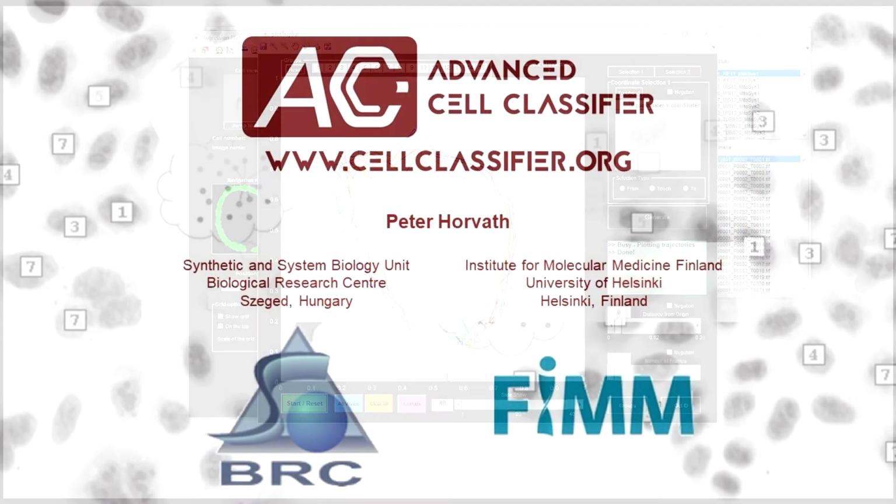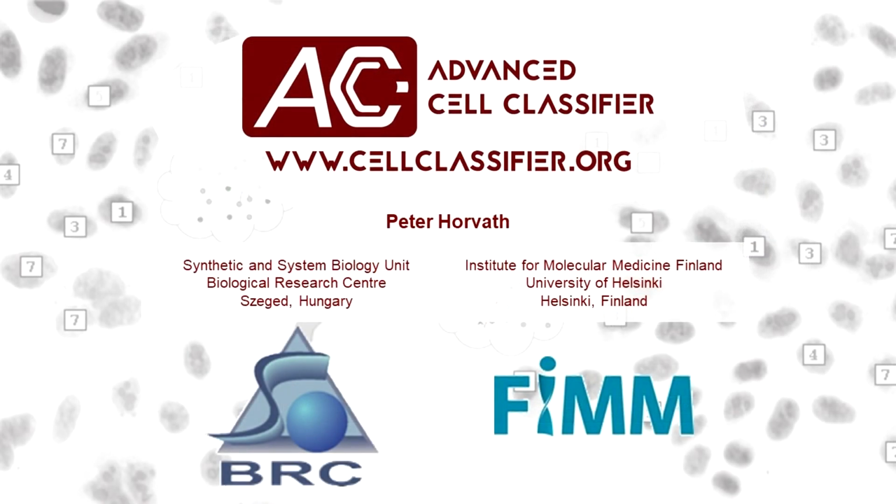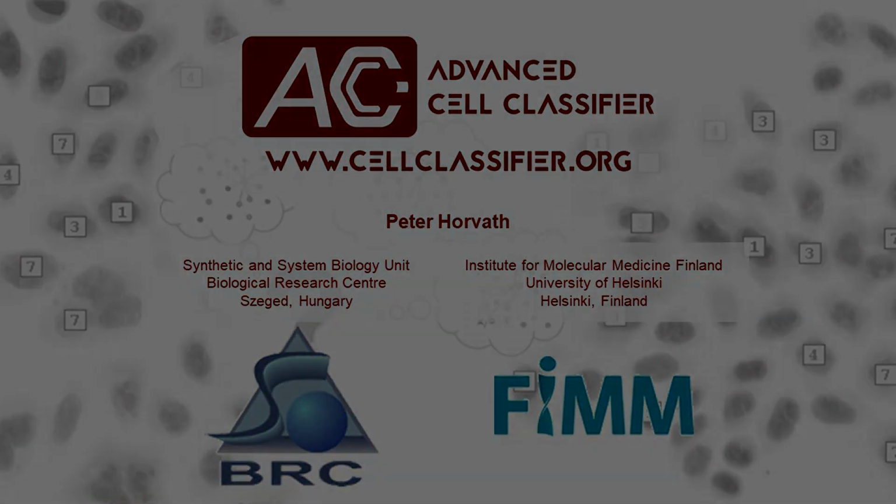You have now seen the main output possibilities of the regression plane. To learn about other output possibilities regression plane can offer, please read the help documentation file provided with the software. Thank you for your attention.